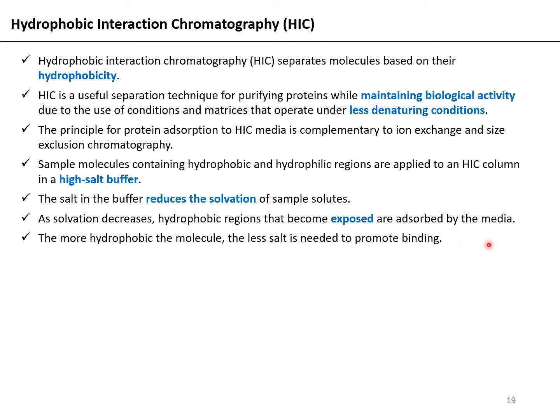The more hydrophobic the molecule, the less salt is needed to promote binding. So for more hydrophobic molecules, you need a lesser amount of salt to bring out the hydrophobic regions and promote binding. And the lesser the hydrophobicity of the molecule, the greater the salt concentration required to promote binding.